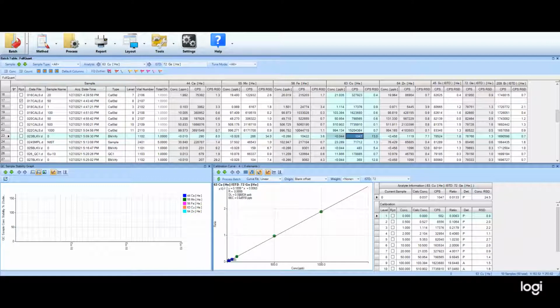The detection limit goes to about 8.8 ppt, and that just means that, of course, if we have a background equivalent concentration of 33 ppt, then another 8 ppt will increase the total counts for copper. And so we can detect that, and we do detect that. And this is the detection limit for copper.